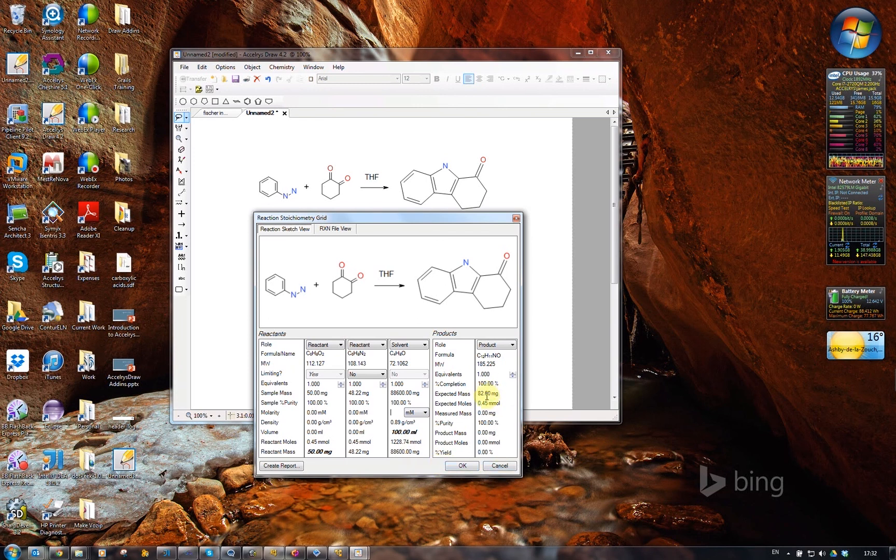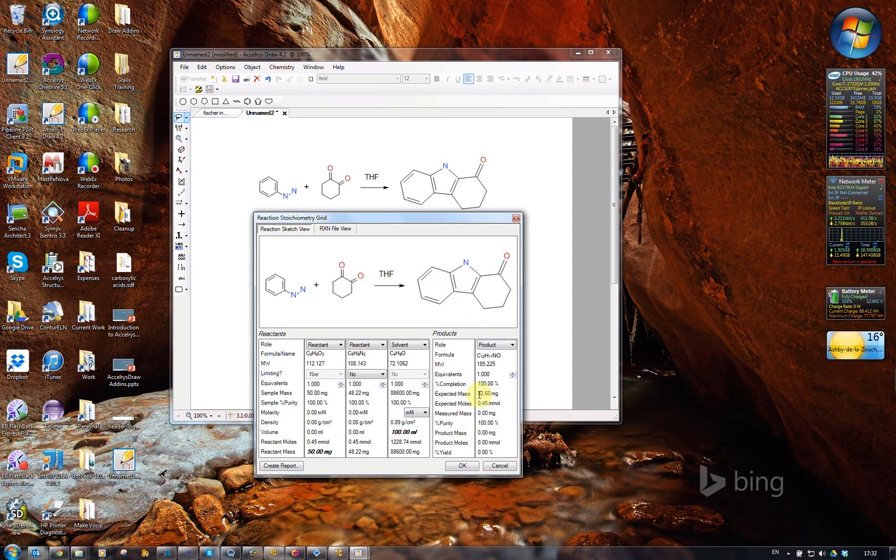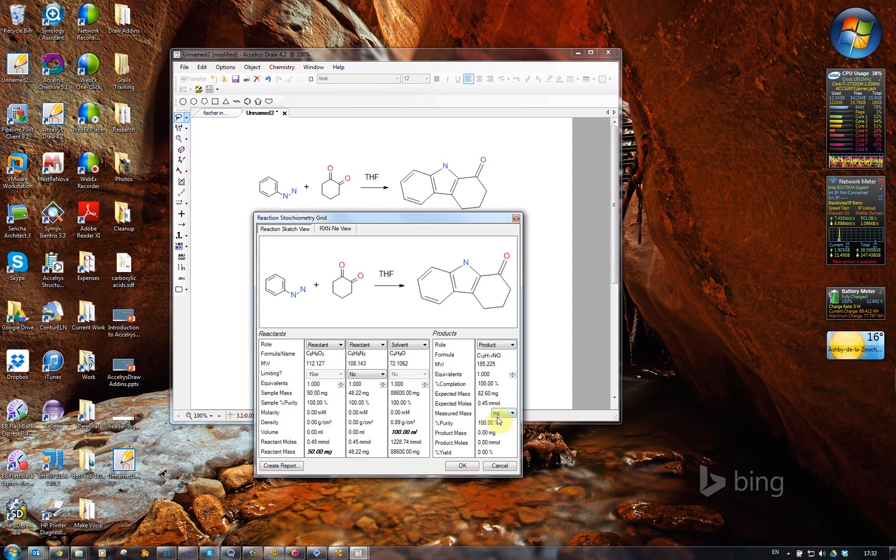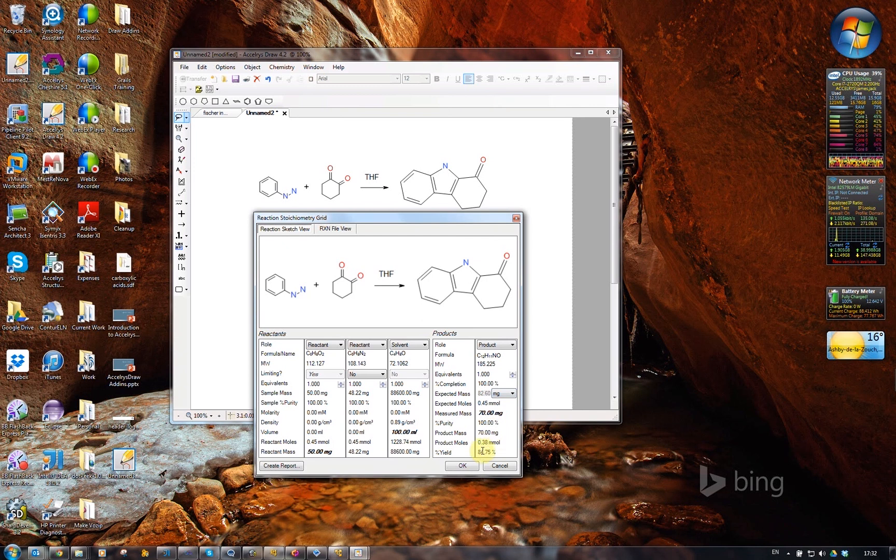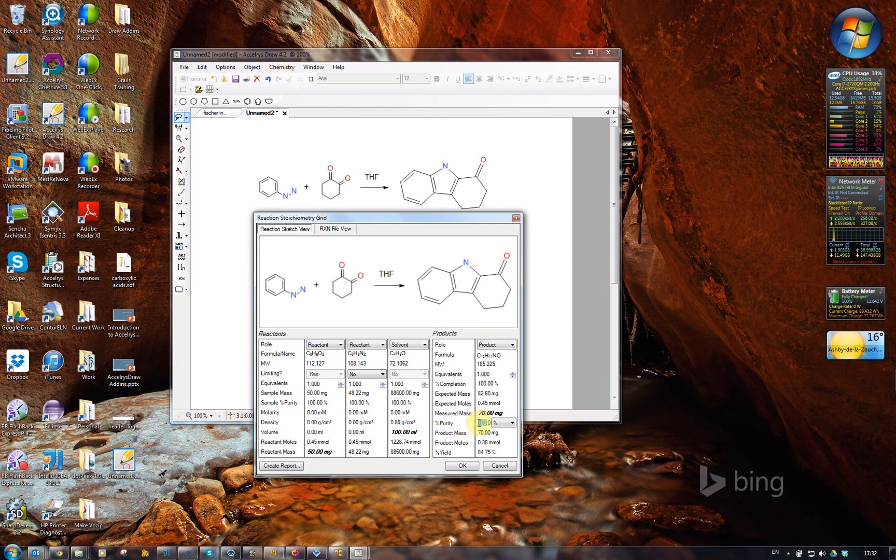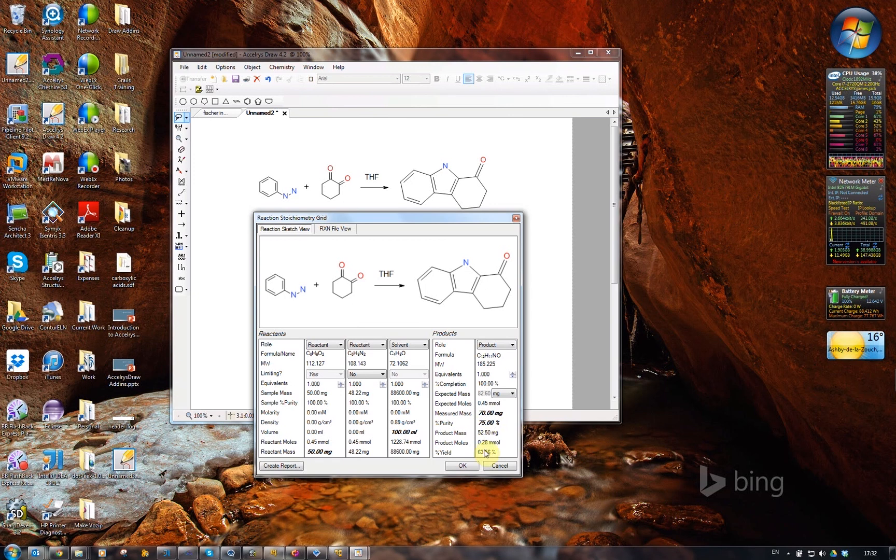Over here, it's calculated what the expected mass is for the product. If we say we're going to use 70 milligrams, then it works out what the yield is. We can even say we've got 70 milligrams, but when we measured it, it turned out it was only 75% pure. And there's all the yield calculations for you over here, the actual product mass, the number of product moles.